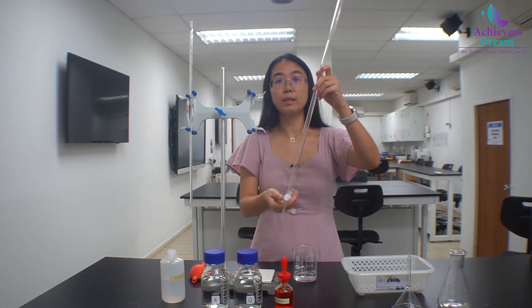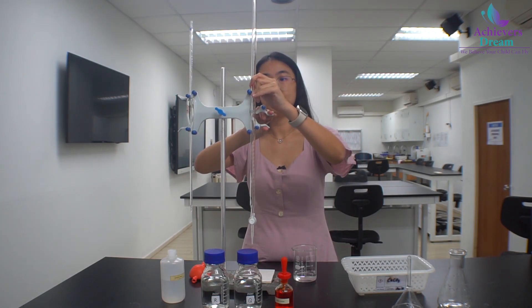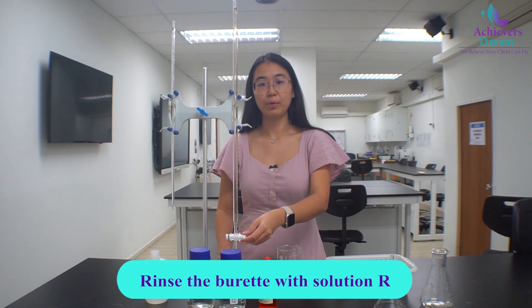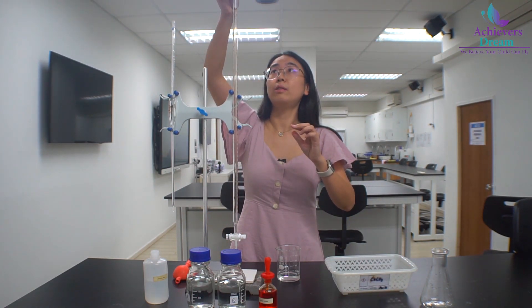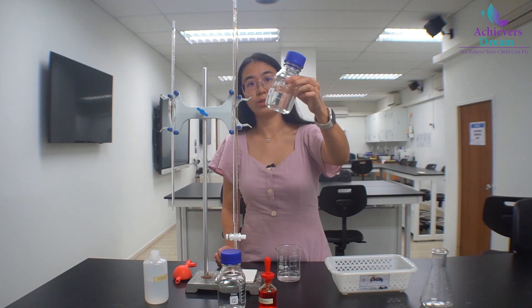Once this is done, we can rinse the burette with the solution that it should contact. Repeat the steps to rinse the burette with the solution. Make sure the stop cork is closed. Place the filter funnel at the top. For this experiment, we are using solution R.